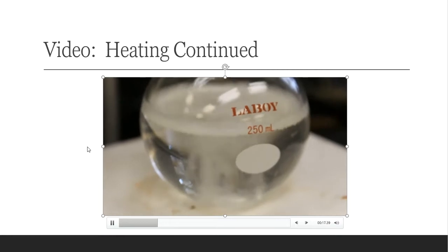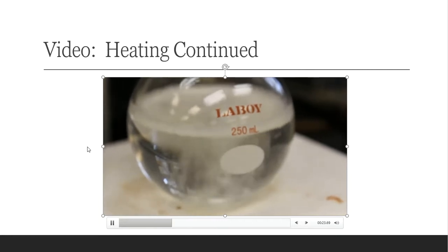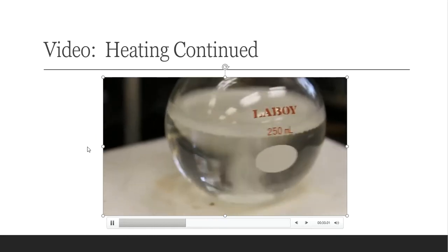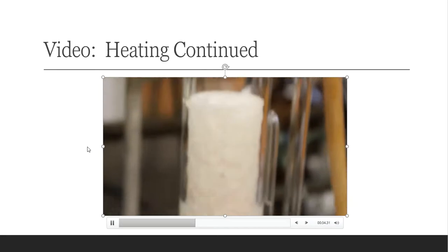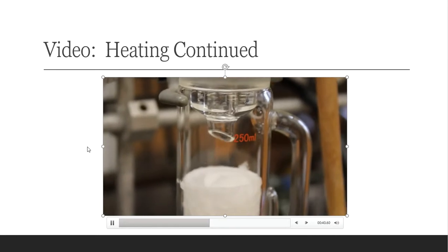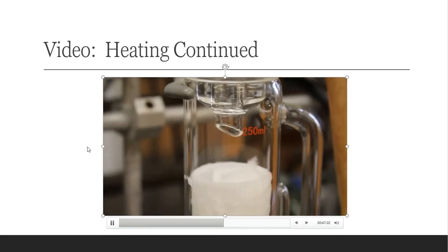All right, so this is what the temperature setting is doing for my petroleum ether. Notice it is at a full boil at this point. However, this boils at a really low temperature. It's not like boiling water. And that ether is still continuing to climb into my Soxhlet up here at the top. You can see where my liquid level is right now, right here. And if I look at the Soxhlet, you can see how fast it's dripping, at least one drip per second, if not more.